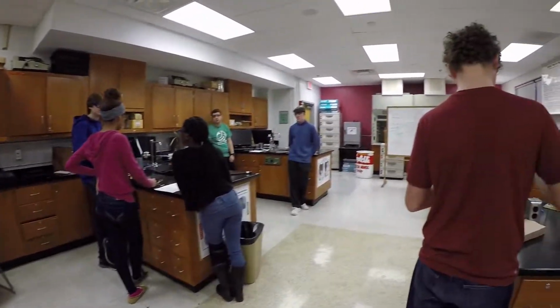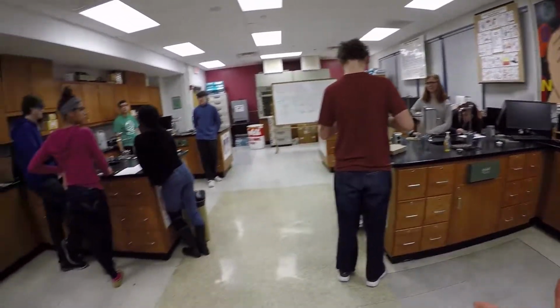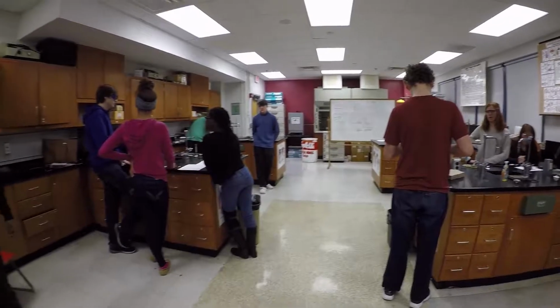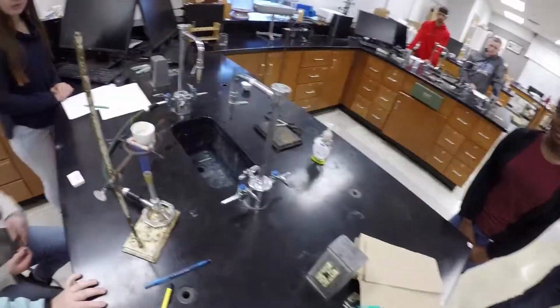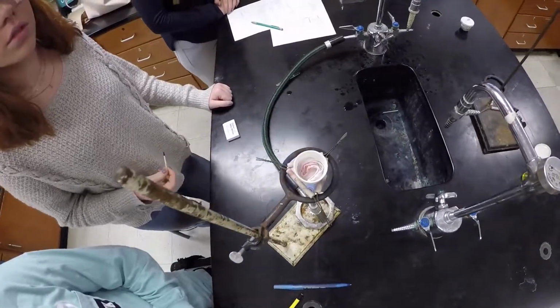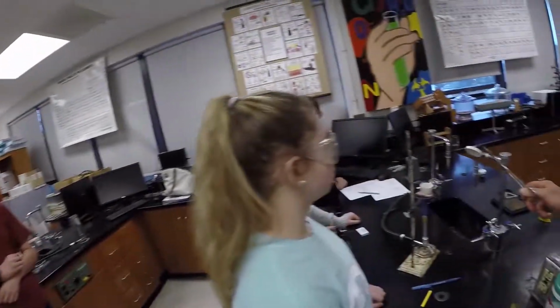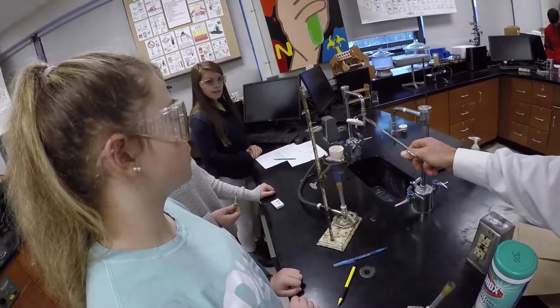Yeah, the burning magnesium will be very bright. So you don't want to look directly at it because you'll be seeing spots. But you can see how the oxygen's reacting with the magnesium. Whoa, there's white smoke coming out, not normal smoke. Now you don't want the ashes to get out of there because that's going to affect your results.